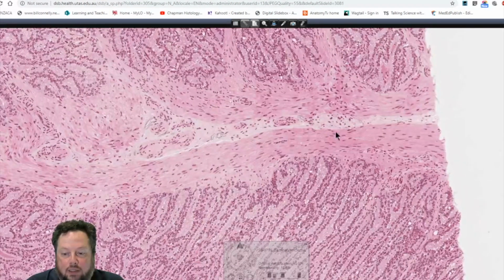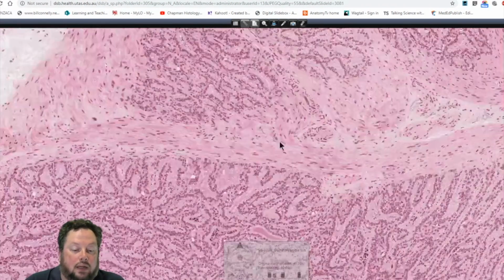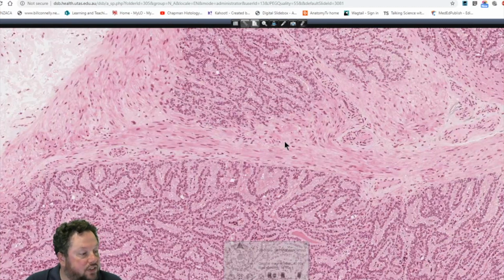On the outside here, there's connective tissue. There's a tunica albuginea in the testis, so if you've just come along, you might have missed us talking about the tunica albuginea in the testis. There's also a tunica albuginea in the penis, which we'll talk about in a little while. So we do find tunica albuginea in a number of different parts of the male reproductive tract. Remember, we also saw it in the ovary.